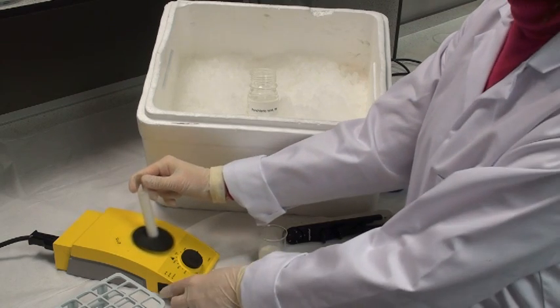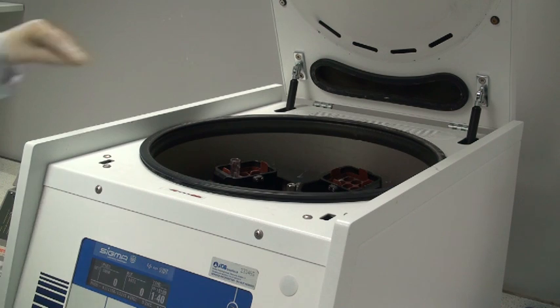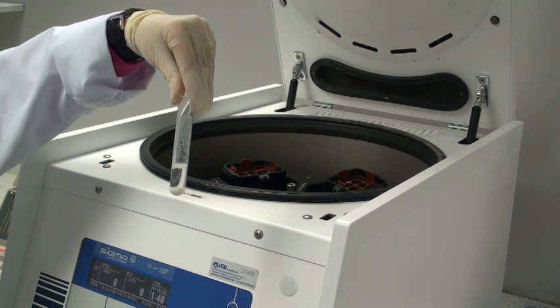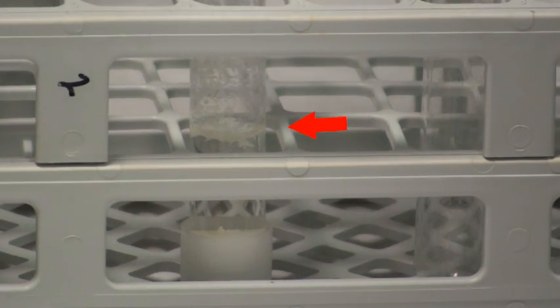Then centrifuge the contents of this tube at 1500 g for 10 minutes. The sample tubes are removed from the centrifuge and the clear supernatant solution is used in the next step of the sample preparation. With some samples, after treatment with perchloric acid and centrifugation, a small amount of denatured protein floats on top of the clear supernatant. Care should be taken when removing this solution to avoid collecting that precipitate.